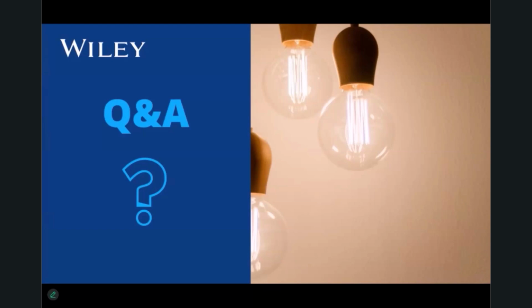So you could also use the models to do a first pass quickly and also categorize the sample. And you could even think about adding an SDK to automate the process even further. It's kind of more about speed than anything else.